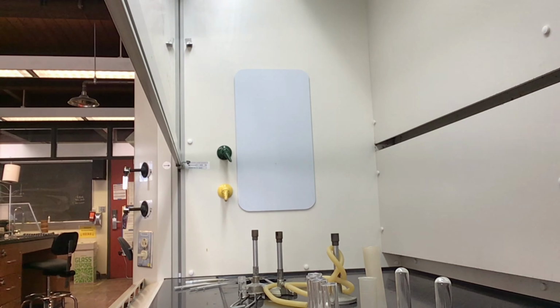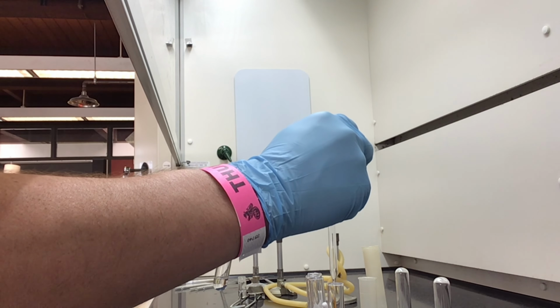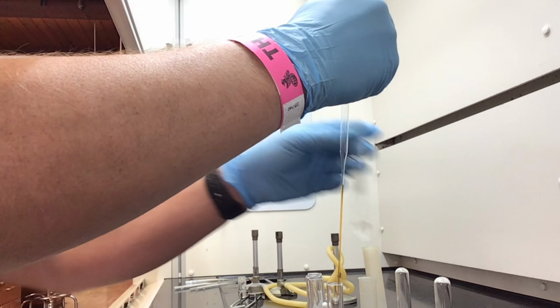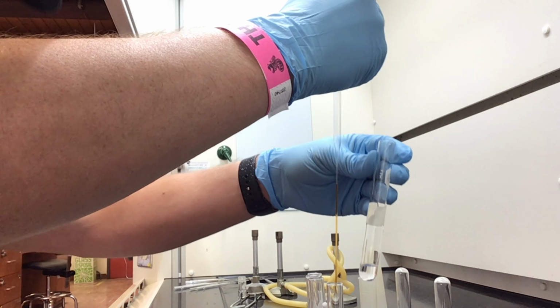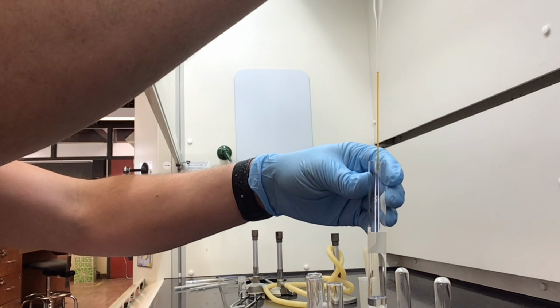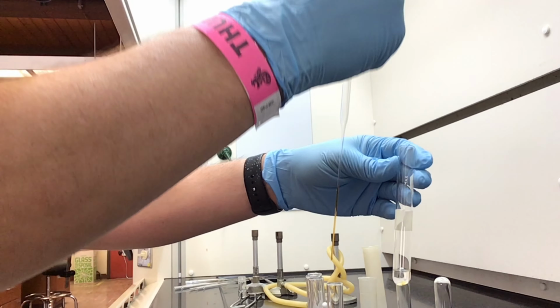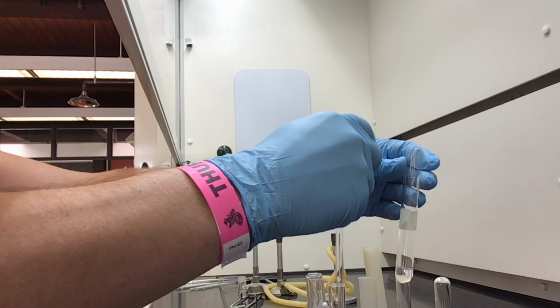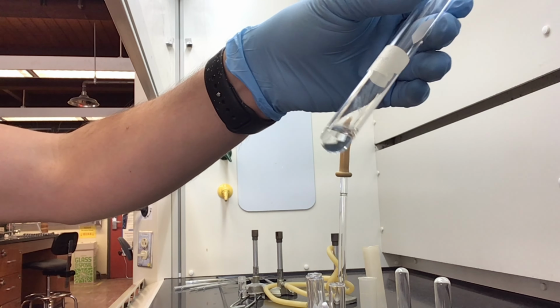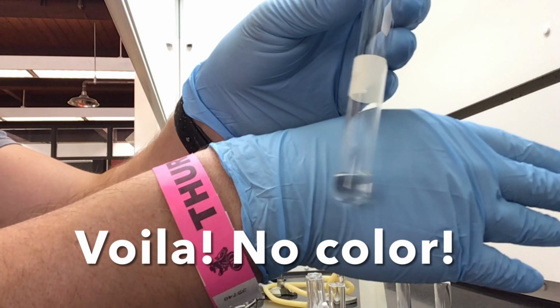So, let's see what happens. Okay, we'll just drip it in like usual, and then watch the magic happen. It's there at first, and then it's not. What? Are you serious right now? That's magic. Chemistry is magic. All right, give it a little shake, make sure. Okay. All right. Voila, no color.